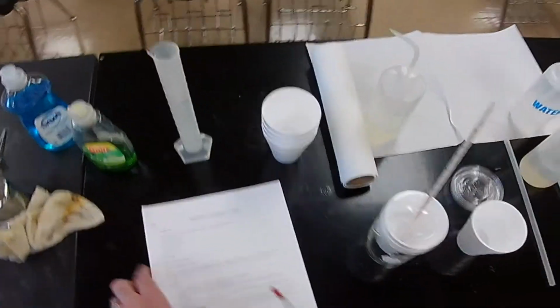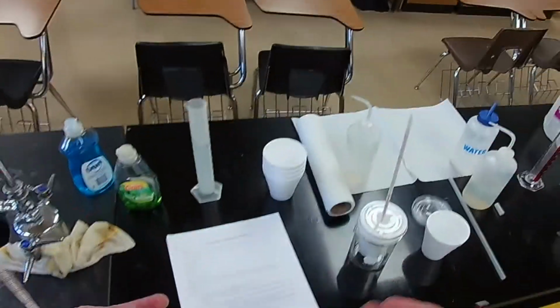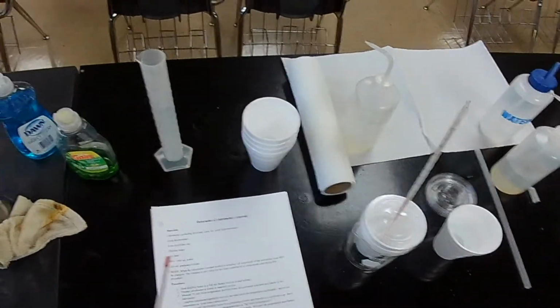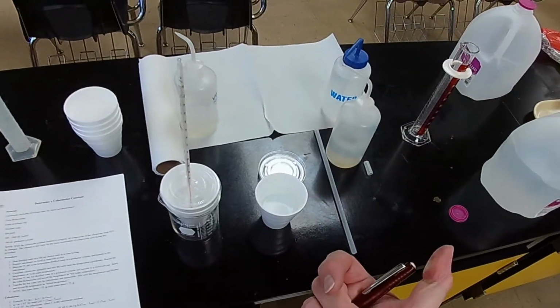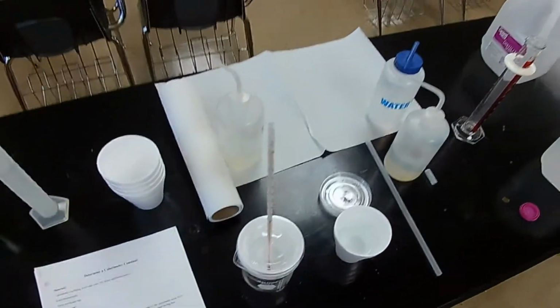And since timing is so critical, you would have your lab notebook right here, to write the numbers down. So your partner would write if that were the case. But in this case, I'm going to write these down and then put them on the board.